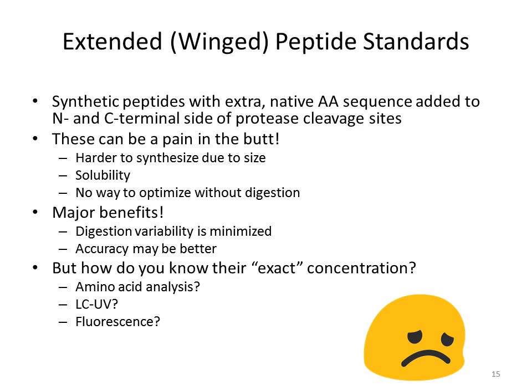And it sounds pretty straightforward. If you digest a protein or a peptide into its components and you already know the sequence, you should be able to figure it out, right? Well, not every amino acid responds really well, and they don't all behave like the standards, and not everything hydrolyzes well. And if you messed up the pipetting, you are not going to get the right answer. And so this amino acid analysis process is like, you get a number plus or minus 30%-ish maybe. And so it's really difficult for us to absolutely quantify how much of a protein is present in a sample from a peptide or extended peptide standard. Even from a protein standard, it's very difficult for us to know for sure.